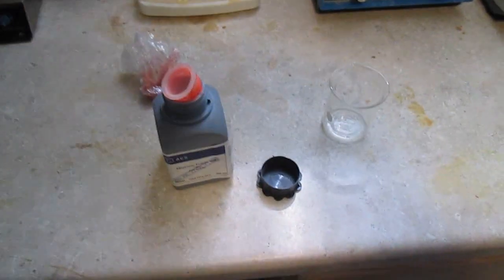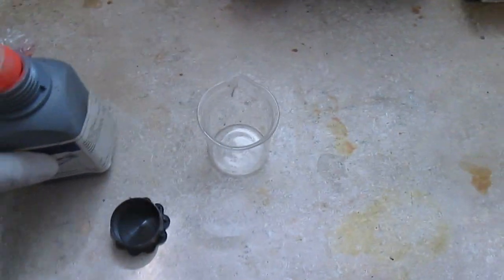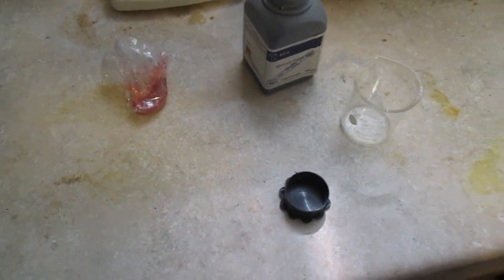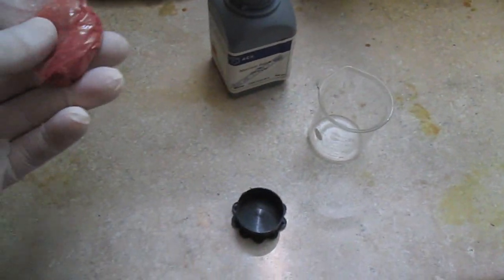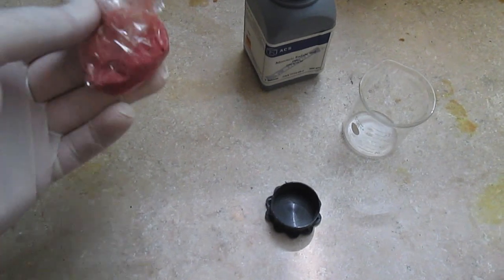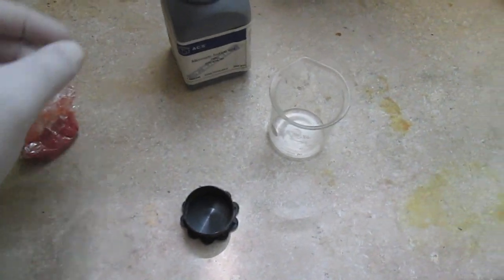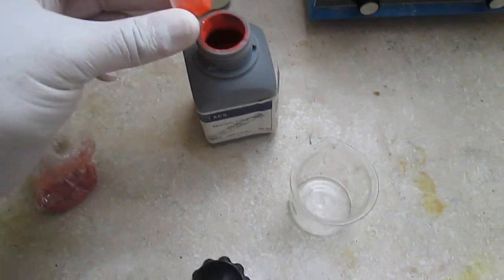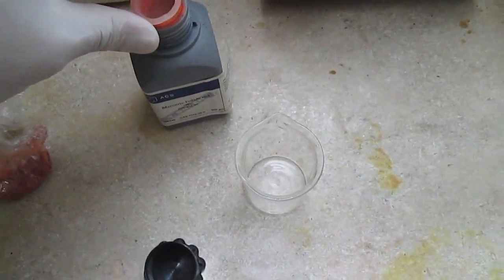As I promised, I was going to make a video on mercury — how to isolate it from its salt. One thing I like about mercury salts is the color. They have very bright colors. This is mercury sulfide, this is cinnabar, this is mercury iodide — very bright, very nice colors.